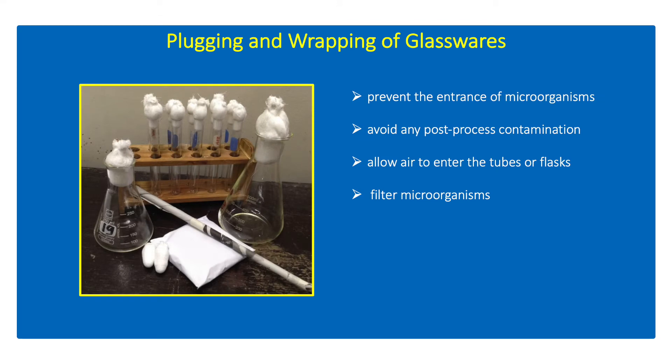Plugging and wrapping of glasswares are done prior to sterilization to prevent post-process contamination of the media and tools to be used in a microbiology experiment. Exposure of media to air alone can provide significant sources of contaminants such as bacteria and fungi.